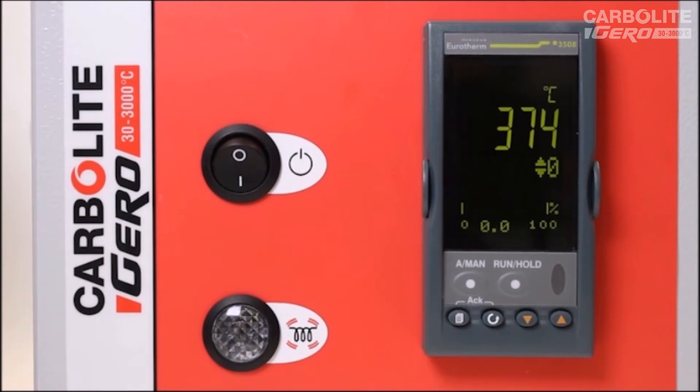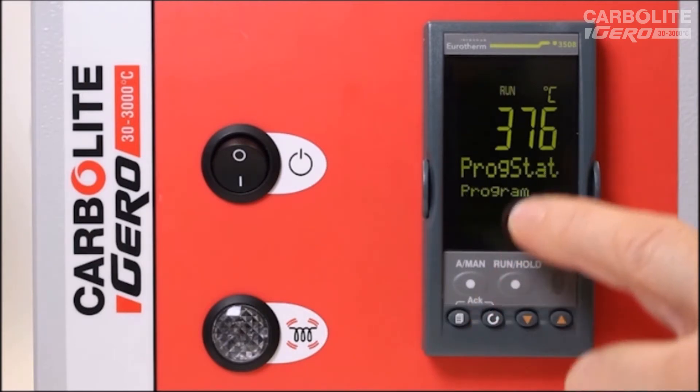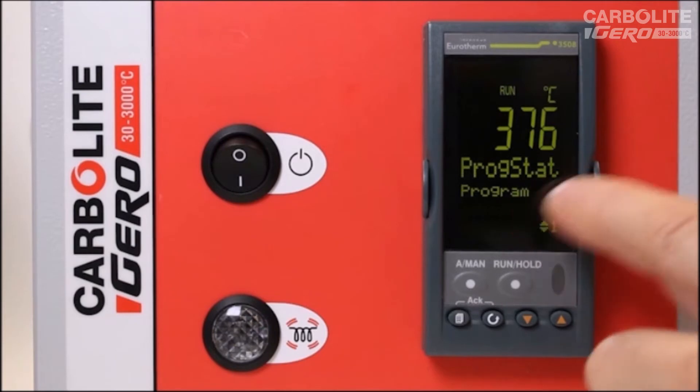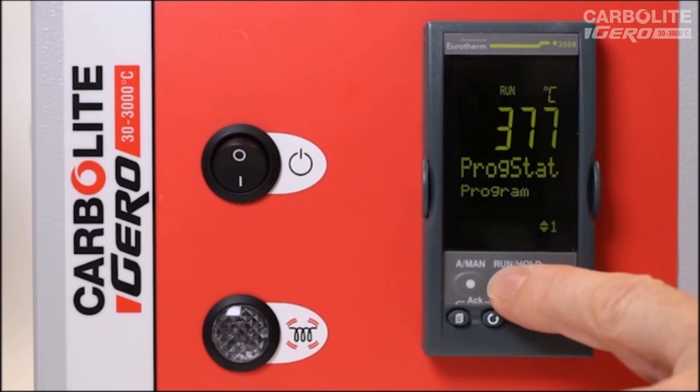To run a program in the 3508 temperature programmer, we use the run/hold button. We press this button once and the display shows 'Run Hold To Start', requiring confirmation with a second press. The run indicator illuminates and the program status screen shows program one is now running.